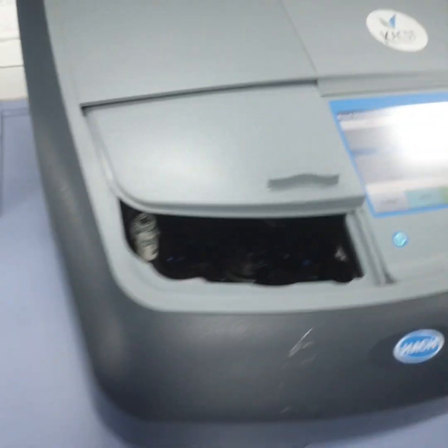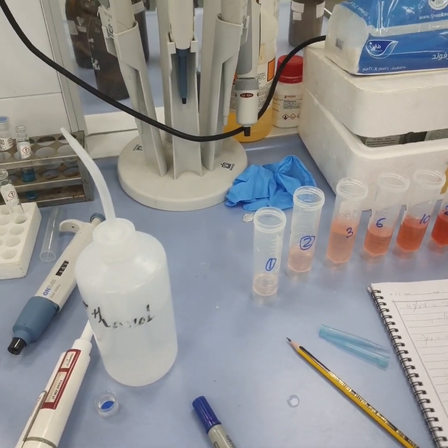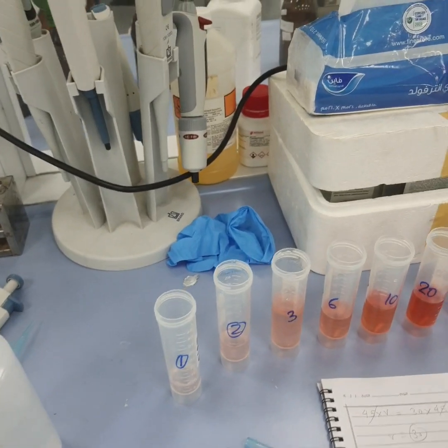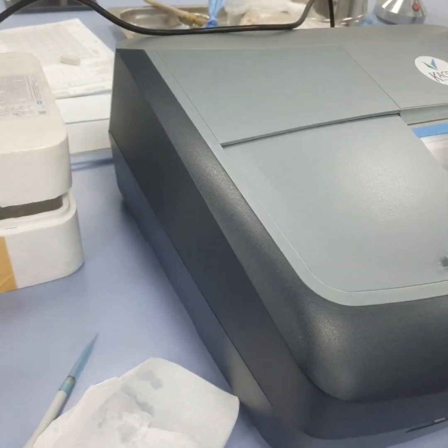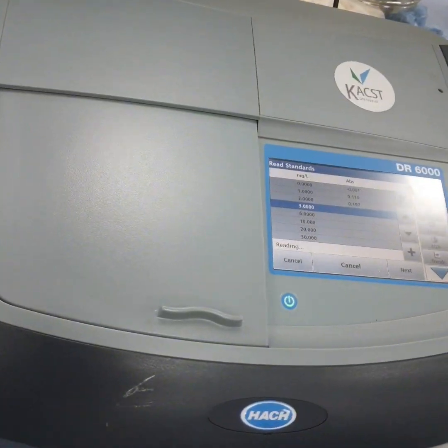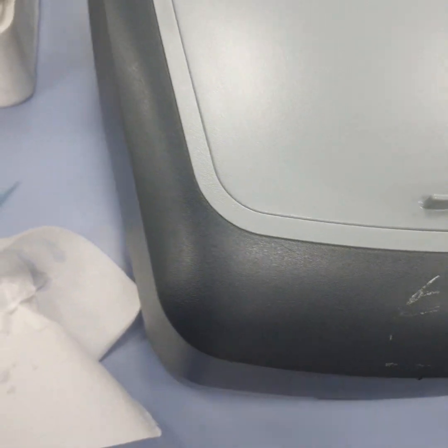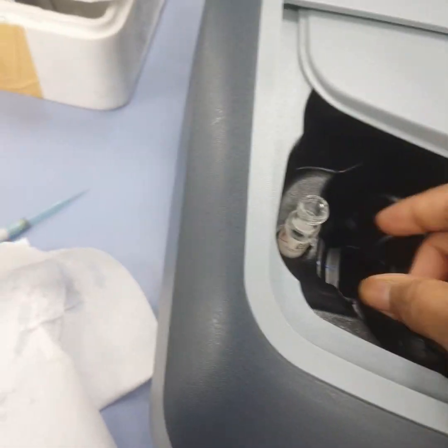Now 3. On the surface of the vials also, there should be no thumb impression. Okay, now put them inside the holder. Close your UV and then read. So there is a problem. You see, it should be 3 times 1. No problem. Throw it away.